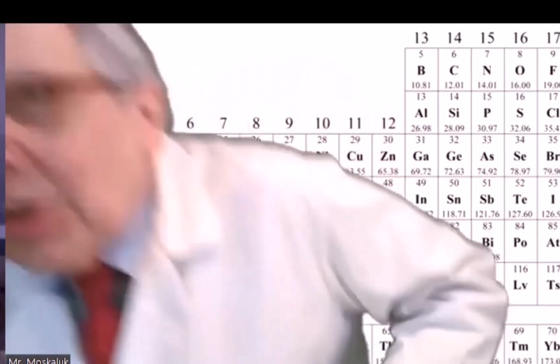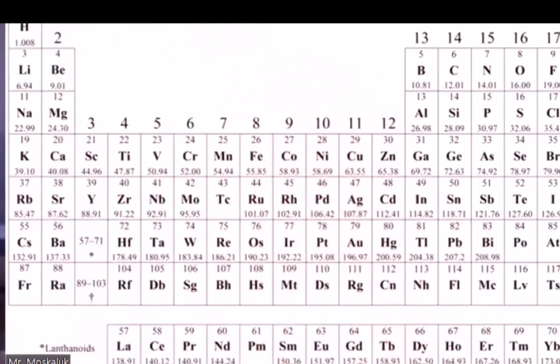We did our reaction rates. Here's another reaction rate demonstration. This is a classic. They don't do this much anymore because a lot of labs don't allow you to. We cannot see the react.